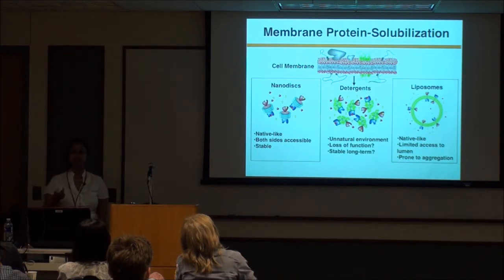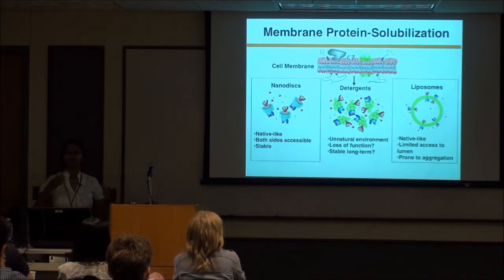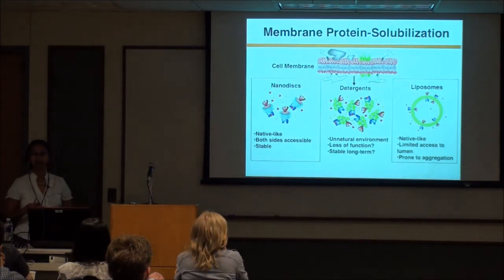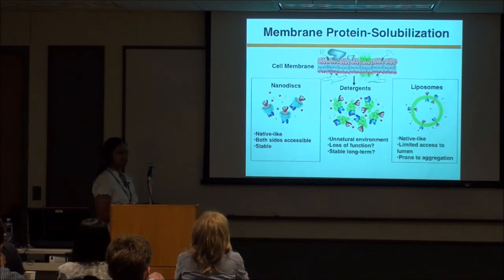And if you take out a membrane protein in detergents, it can be unstable over a day. Like you start an experiment in the morning, by the time it's 8 o'clock, your experimental system itself is different. So the data people get on membrane proteins can vary depending on the lab, depending on the graduate student who did the experiment, and you don't want that variability if you really are studying something, right? So the other method people use is liposomes.